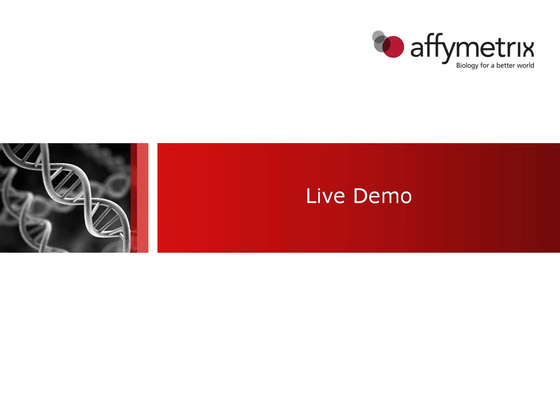Now I'll transition to the TAC software itself, in which I'll be able to show you a live demo how to set up the analyses.